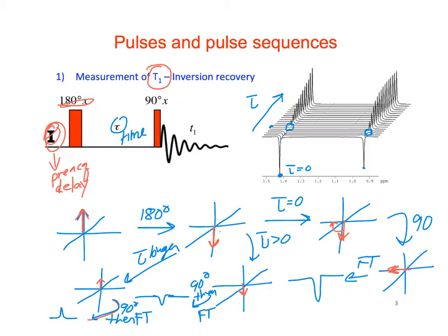On the tau greater than 0 plot, you have the red arrow in the negative z-axis. Is it supposed to be relaxing up towards the positive z-axis? Right, so what's going to happen is it's going to tip upside down, and it's going to start relaxing up like this. If we wait long enough, it'll relax up through 0 and then relax up to the top.